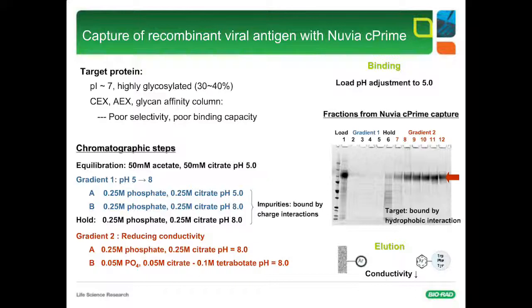So if you have under 1,000 Dalton, that's the peptides. Peptides, right? Okay. Thank you for putting that in. If you are interested in testing, we can send you samples. Oh, we have something we can test. Okay. So perhaps if this doesn't work, we are constantly trying to find resins that would be of value to you. So that may be something we can certainly do. At this moment, I don't think we have something specific for this size range. Is that a fair answer?